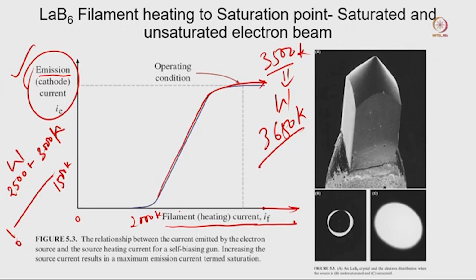What kind of heat energy is required to get proper emission depends on that particular filament, and also on the vacuum and microscope condition. Based on that, we have to play around with those parameters. So it is not a good idea, if your brightness is low, to just increase the heat energy of the filament to get better brightness. It is not going to work that way.